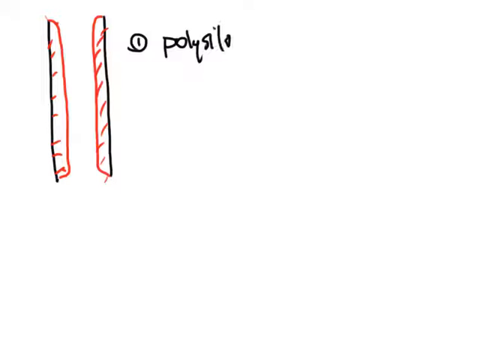But capillary columns have a thin layer of stationary phase around the whole interior wall of the column itself. And here is the stationary phase in red. And we said there's two different forms. One of these is called polysiloxanes, and the other form is called a PEG, polyethylene glycols. So these are the two basic foundational stationary phases that we can use in a capillary column.